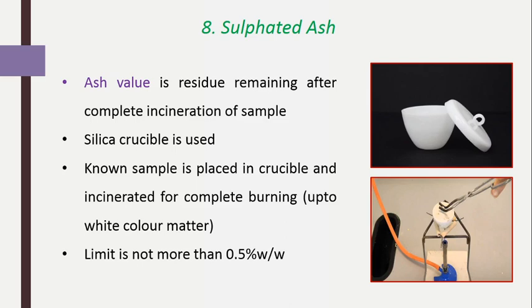In this absorbency test, the sinking time test and water holding capacity, two tests, are used to observe the absorbency. After that we have seen the fluorescence test, done using a 365 nanometer UV lamp. After that we have seen the NEP test. NEPs are entangled or knotted fibers in the absorbent cotton. How much amount of NEPs is present in the particular sample is checked.